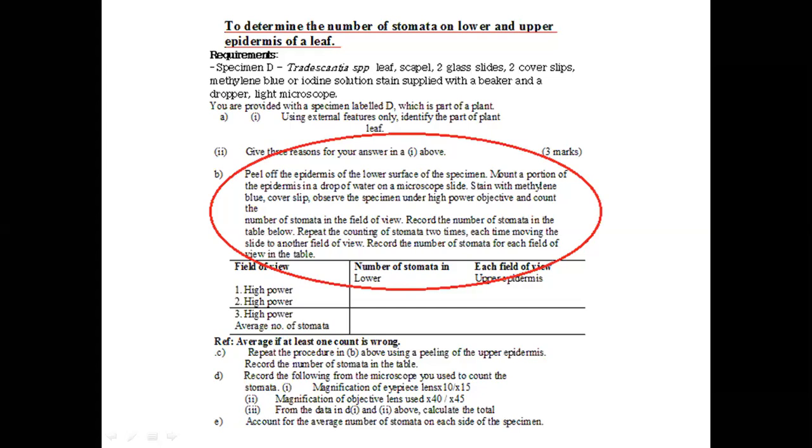And you see now, it actually took me aback, and I realized how sometimes we, even as experts, take some things for granted. Of course, when you're given a leaf, the first thing that should come in your mind is how to peel. We peel. Sometimes the examiner may not tell you how to go about it.